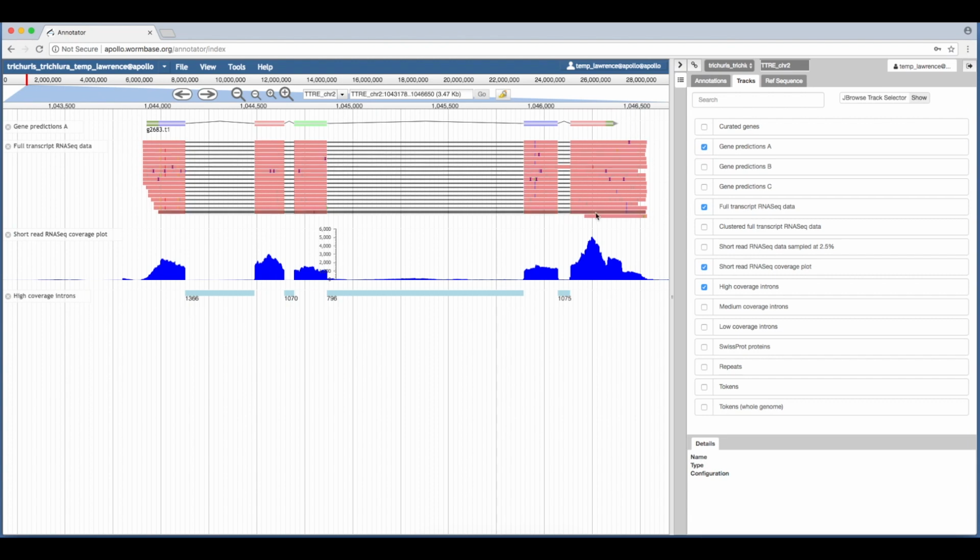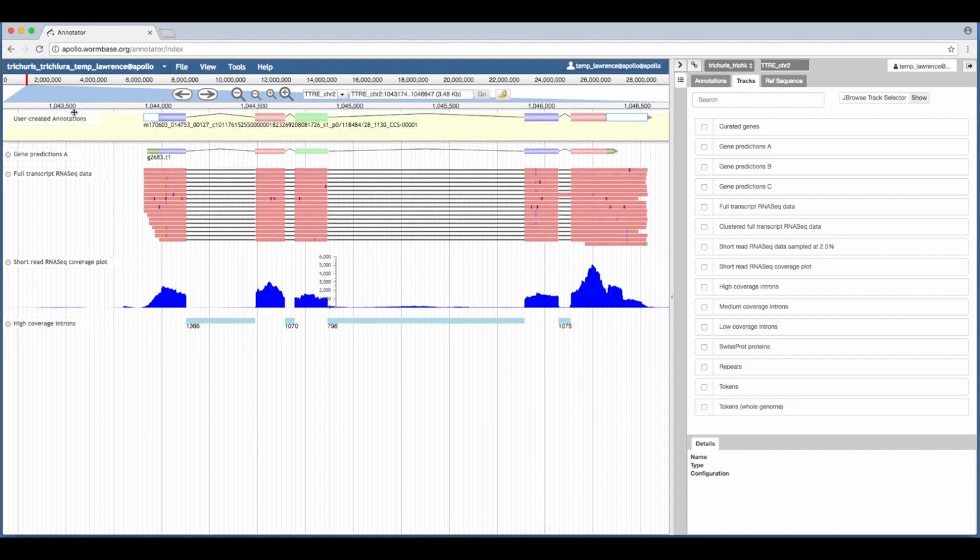So I'm going to take a look and I'm going to select the longest read, this top one here. So right click, create new annotation, gene. So now we have this gene promoted to the scratch area. I'll look for any of the other reads, but they all seem fairly similar, apart from differing in length. So for now, I'm going to assess the one that I've already promoted.